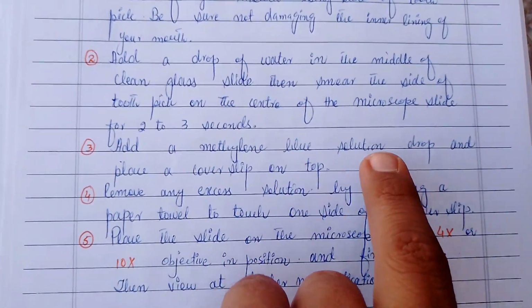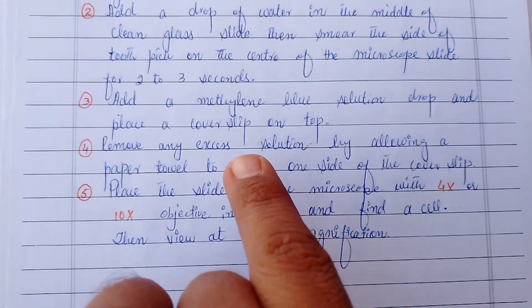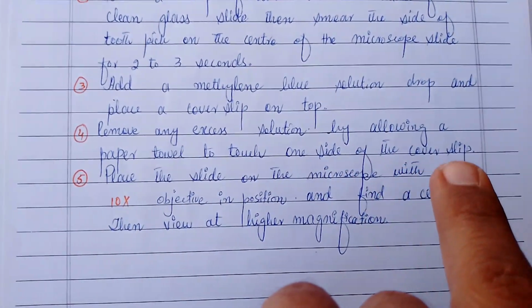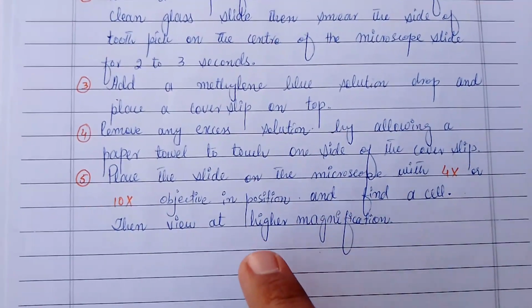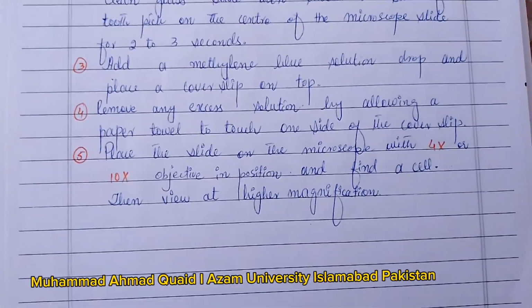Point 3. Add a methylene blue solution drop and place a cover slip on the top. Remove any excess solution by allowing a paper towel to touch one side of the slide with the cover slip. Place this slide on the microscope with the 4x or 10x objective in position and find a cell, then view at higher magnification.